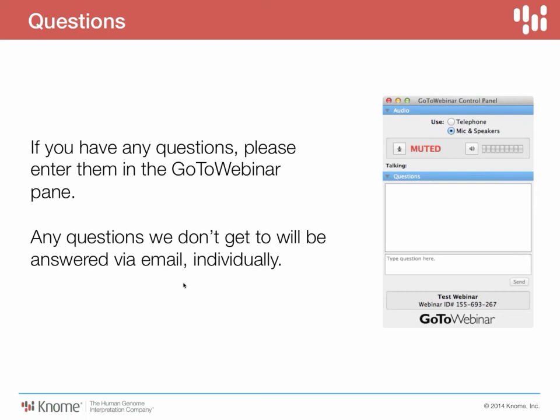Okay. Moving on to another question. There were several times where you used what we called the gene finder when you were searching for a term to find implicated genes. And the question is, how is that term standardized, and how are the diseases associated with those genes returned standardized? Because obviously there's a lot of different ways you could type something or describe something. How does the Gnosis handle that? Yeah, that's another great question, and a difficult issue.